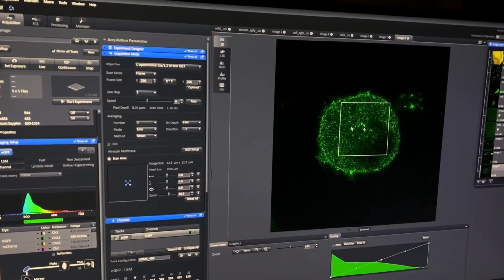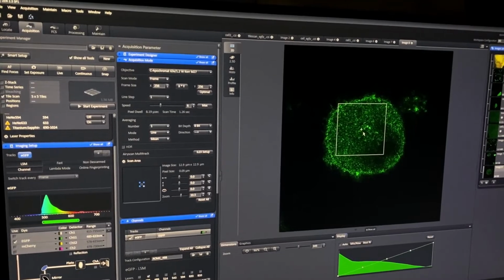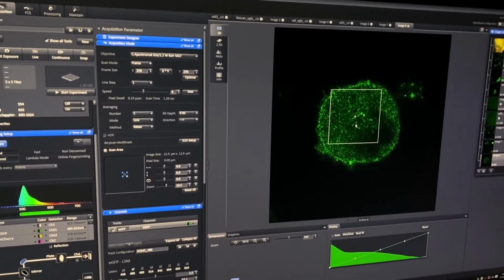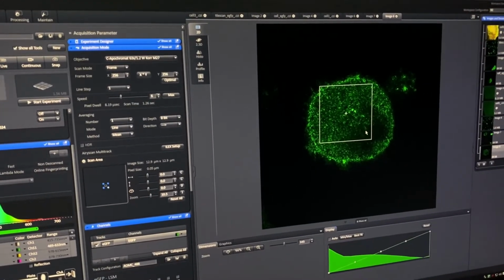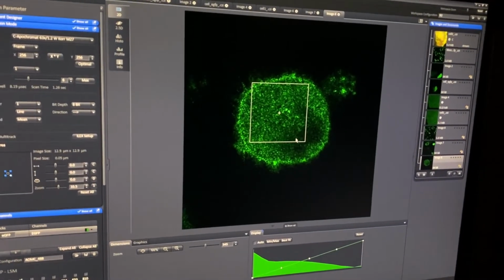You choose a little bit of the nuclear region and a lot of the cytosolic region, because Disc1 is a cytosolic protein, and you're majorly interested only in analyzing the diffusion in the cytosol. You include a little bit of the nucleus just to have a sense of the orientation of the cell.